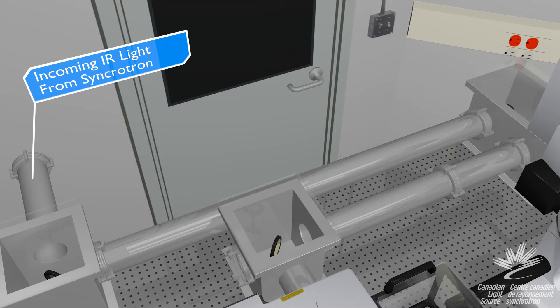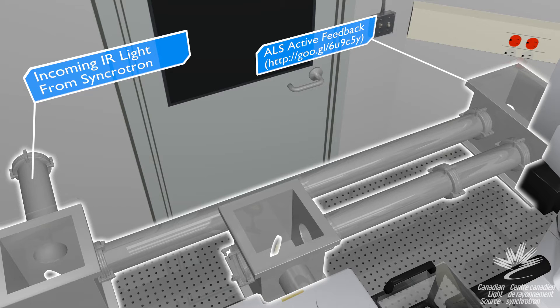This beamline features an active optics feedback system to stabilize the beam, which was developed by the infrared beamline at the Advanced Light Source, Lawrence Berkeley National Laboratory.